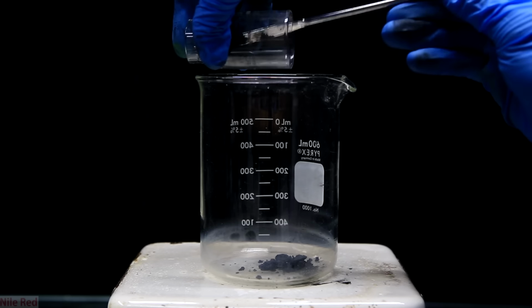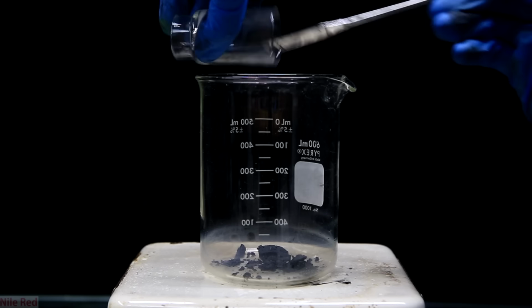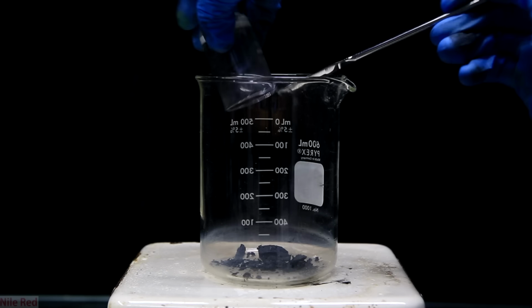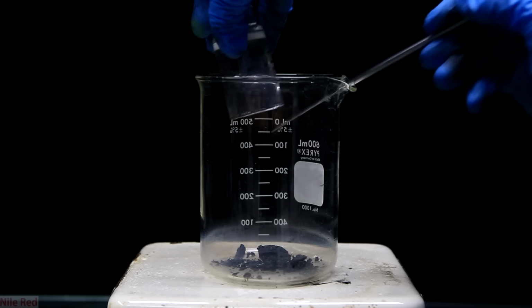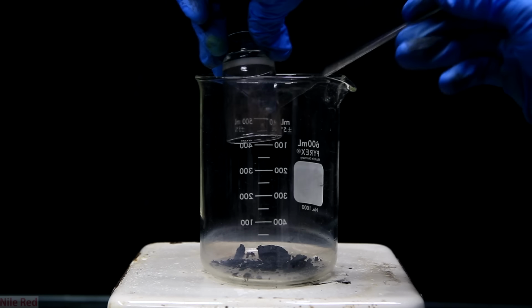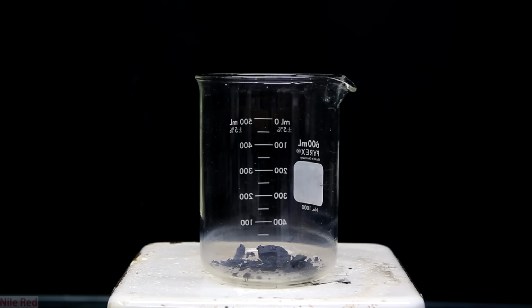In this step, we're going to purify the iodine by evaporation. I think the fact that I didn't use the term sublimation might actually shock some of you. Well, I didn't use the term sublimation because technically the iodine isn't going to be sublimated. The definition of sublimation is the transition between solid and gas phase without going through a liquid phase.